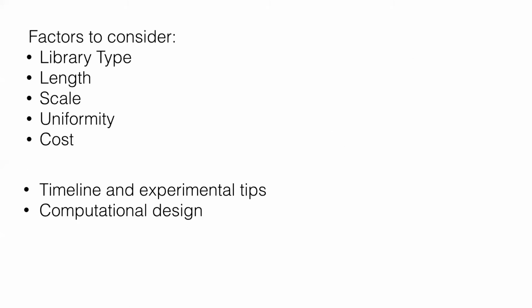And so actually, before I go there, I would just briefly want to make a comparison between oligo arrays and DropSynth. So, if you think about what each one is actually good for. As you already heard, oligos are kind of limited to about 200 to 300 base pairs. DropSynth at the moment, and I'll get into this in a little bit more detail, excels basically between about 300 base pairs and about 1 KB, depending on what kind of yield you're willing to tolerate and some of the other factors. In terms of scales, you can order microarray chips at the level of hundreds of thousands. If you're willing to invest a lot in your DropSynth libraries, you can get tens of thousands. If you're really willing to push it, maybe 100,000.